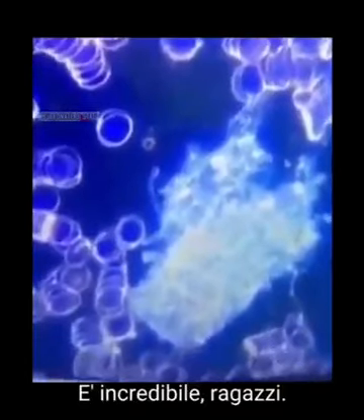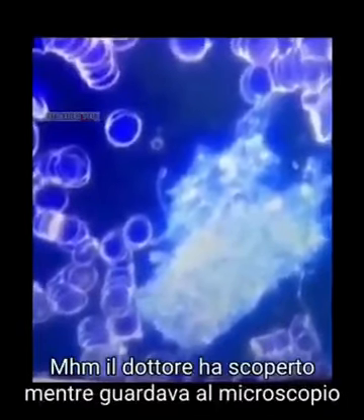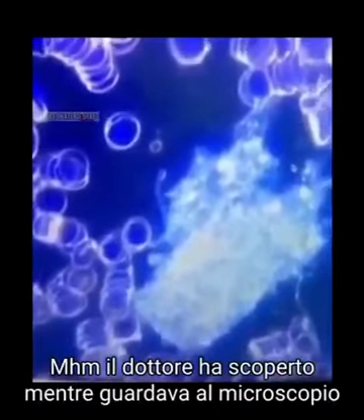Wow. This is insane, guys. The doctor has found when she was looking at this live under a microscope that this crystallized structure was interacting, was growing, was sort of like a network.